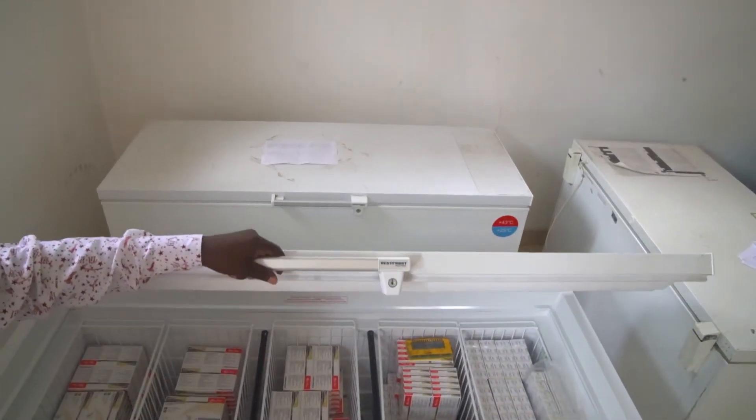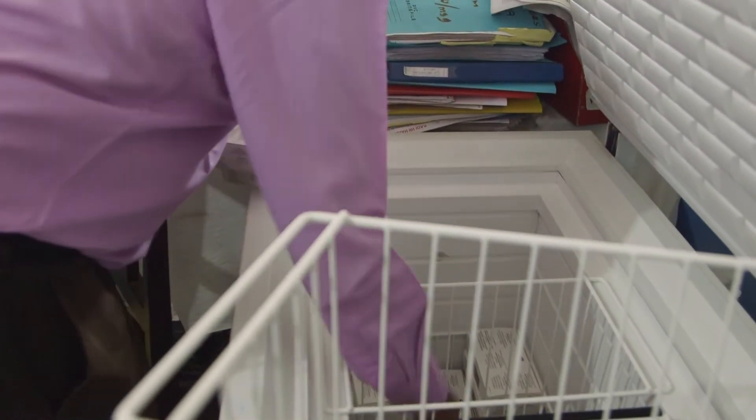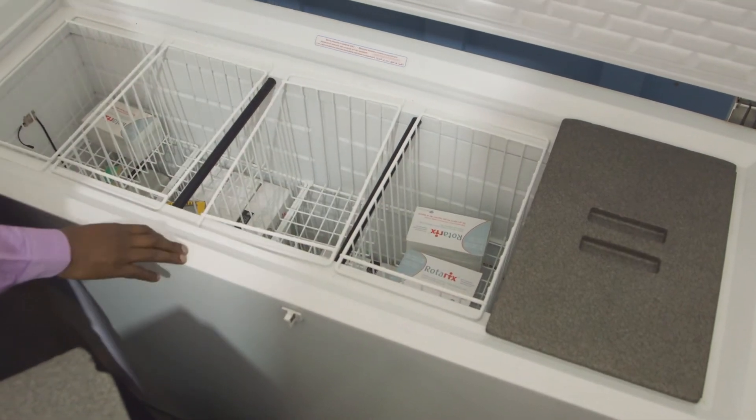No matter which type of refrigerator your facility uses, it is important to know how to arrange vaccines, diluents and water packs inside to keep them at the right temperature.